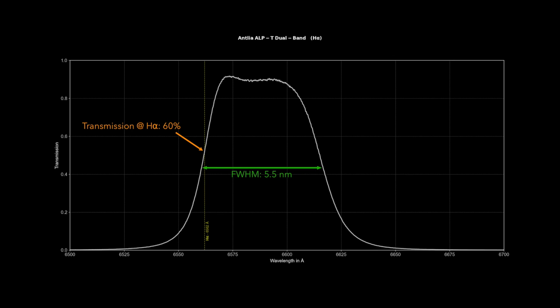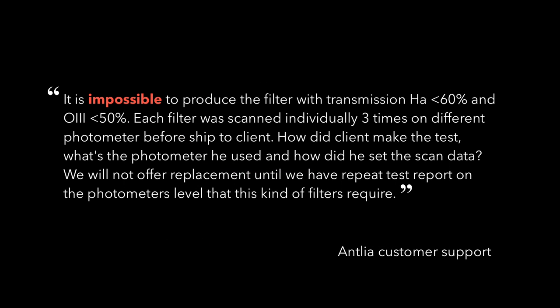In spite of the slightly disappointing transmission numbers, you will still get very good images out of that filter, because you are cutting so much of the light pollution anyway. And that is a big problem, because unless you measure the filter with a quality spectrometer, you would never know that this filter is actually not quite up to spec. Since it costs 380 US dollars, my friend reached out to Antlia to find out whether they'd be willing to provide a replacement, and that is where things started to get off the rails.